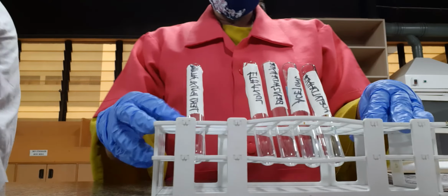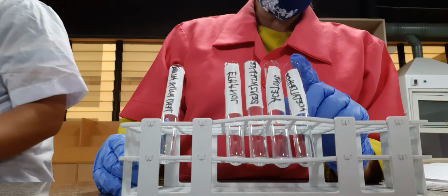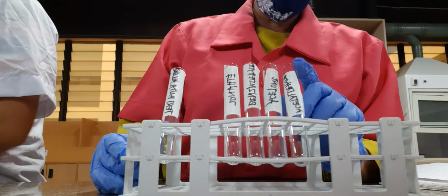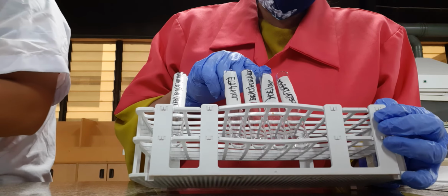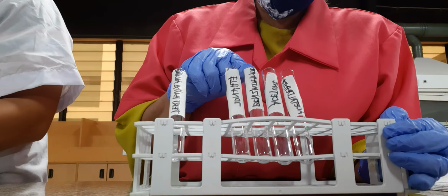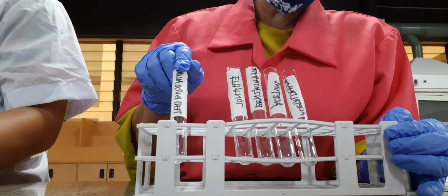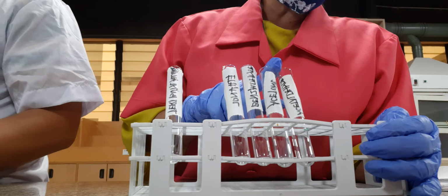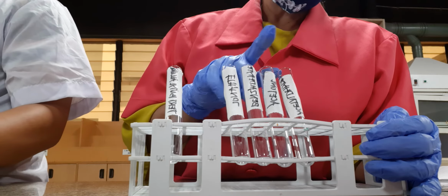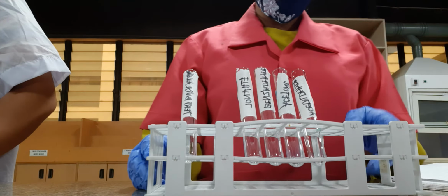Okay. So once again, we have here our substances, our aldehydes and ketones. We have acetaldehyde, acetone, benzaldehyde, we have ethanol, and we have tert butyl alcohol. So we'll have a comparative test with Tollens test, or we call this the silver mirror test.